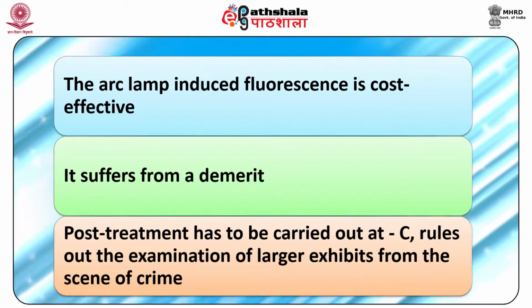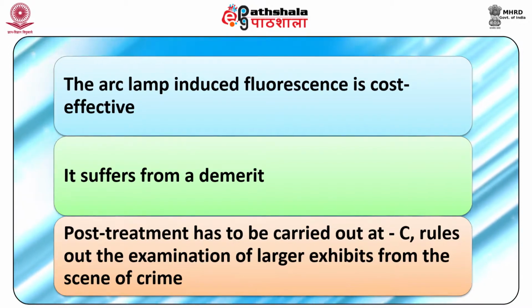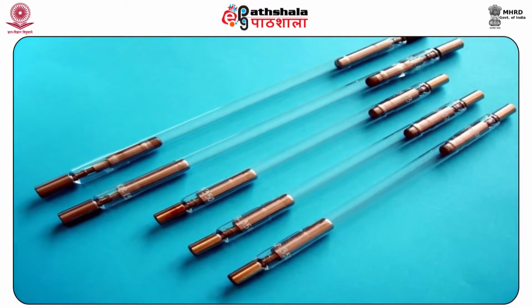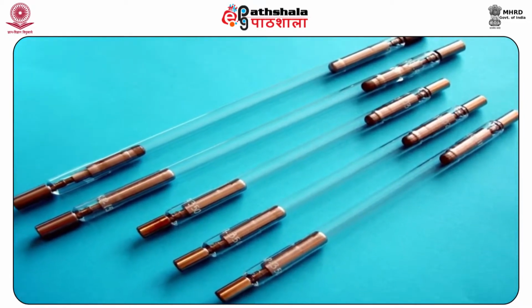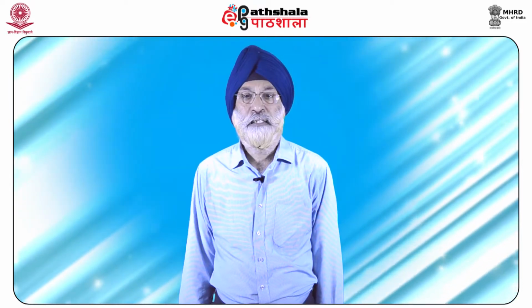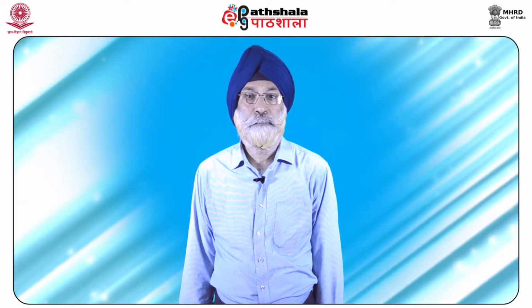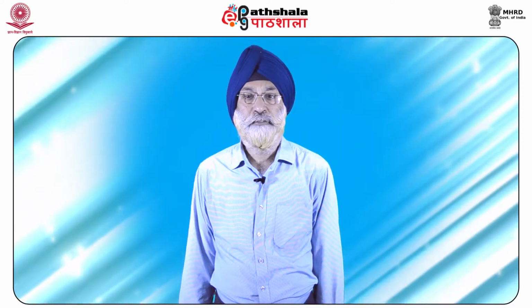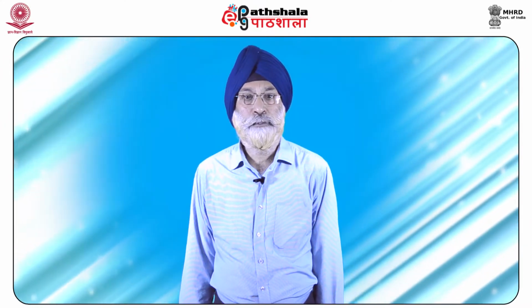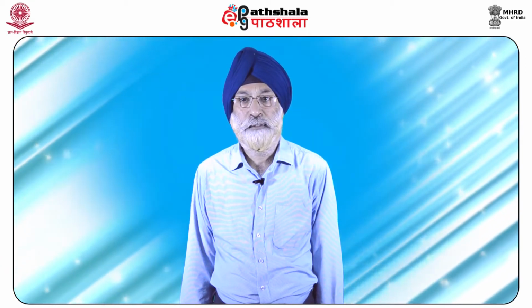It is difficult and impractical to store cryogenic nitrogen in big tanks. The problem may be obviated by substituting the conventional arc lamp with sophisticated laser equipment. With lasers, there is no need to take the sample to liquid nitrogen temperature except in cases which require special handling. Moreover, the rich deposit produces a stronger fluorescence with lasers than with arc lamps.